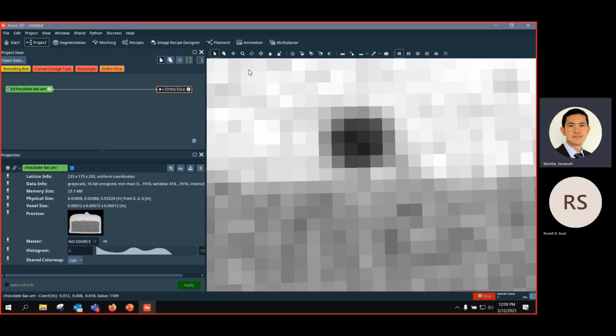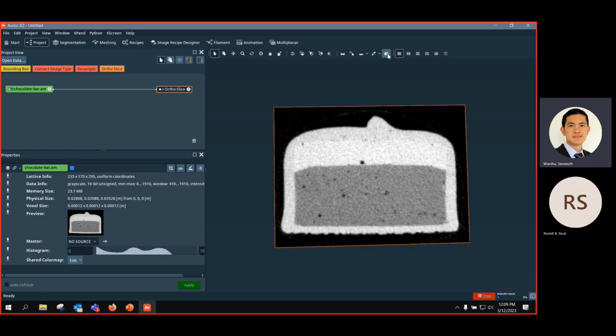Okay, and then we have this snapshot tool. So I go back to this space bar here. We can create a very nice snapshot in one click. So you click snapshot, and then you need to adjust the parameters. I'm not sure why this always keeps this pickup, even in the snapshot. Just hold with me for a moment.